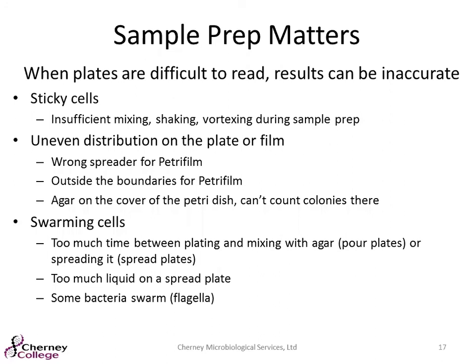So all of those steps that we have just talked about, like proper mixing, proper shaking within the 15-minute time frame. At the end of the day, we want to make sure that we have good plates that are easy to interpret. And sometimes that just does not happen. Those plates can be very difficult to read. Sometimes you'll have sticky cells that can be just improper shaking, not vigorously enough, not long enough. If you've shaken it and then you've let it sit too long, those are all reasons for the cells sticking together on a plate.